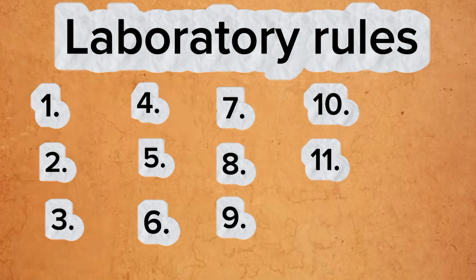Then number 12, the last one but not the least, we have a lot of, but hii ni kidogo tu ambazo nimekuprepare ili uweze at least kujipanga kabla uingie grade ya 7 utakuwa sawa kabisa. Always leave the laboratory neater and cleaner than you found it. Unaona? Unafaa hakikisha kwamba the laboratory is even cleaner than you found it. Unaona? Hakikisha kwamba iko clean kabisa.